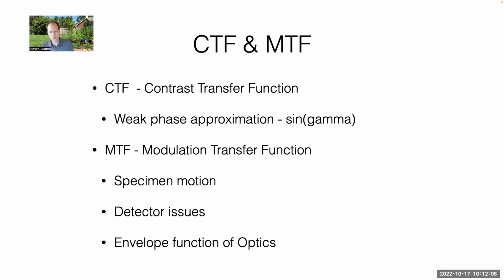So let's talk a little bit about the contrast transfer function, because these are concepts that you'll need to understand for going through the tutorial. Again, to really understand this deeply, you're going to have to know at least a little bit about Fourier transforms. But I think you at least get some gist of the idea, even if you don't understand Fourier transforms very well.